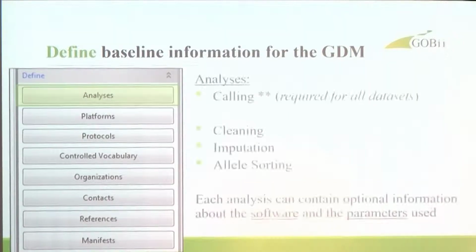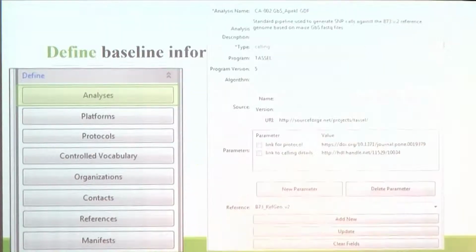Defining analysis. Calling analysis is required for all data sets. There is also cleaning, imputation, and allele sorting. Each analysis can contain optional information about the software and the parameters used. This is an example of defining an analysis. You can add new or update.